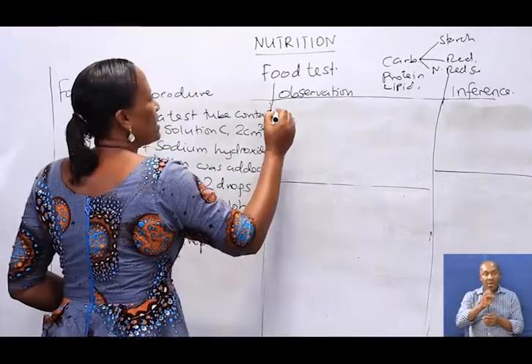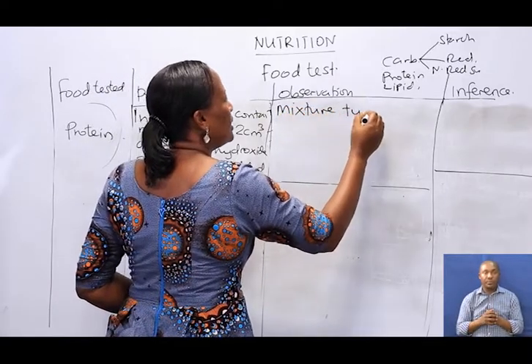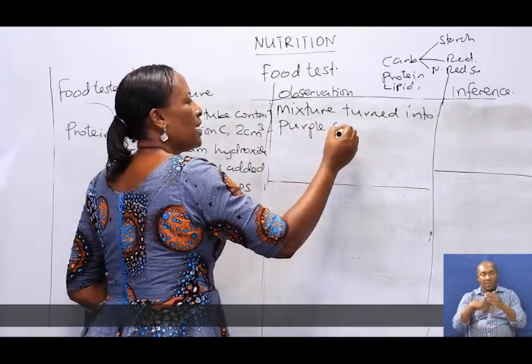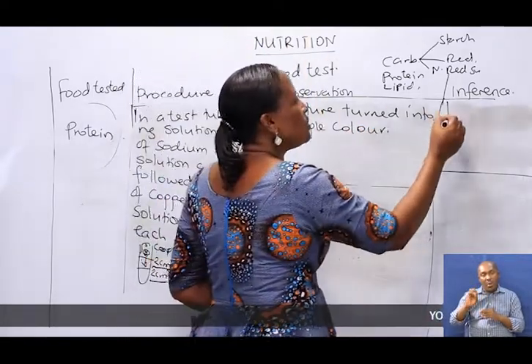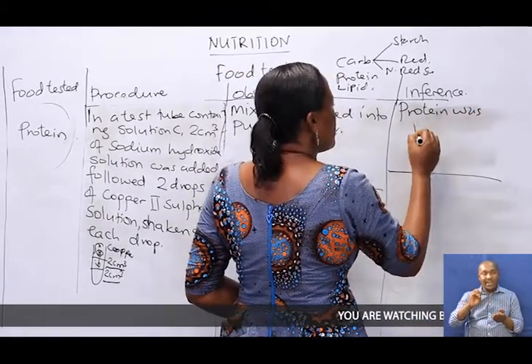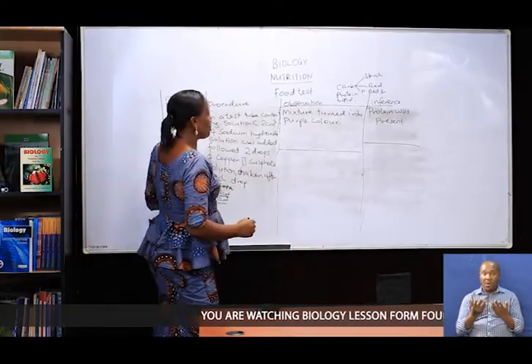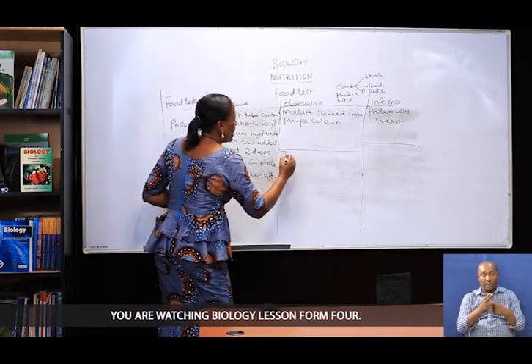So the mixture turned into purple color. This means protein was present. Protein was present.